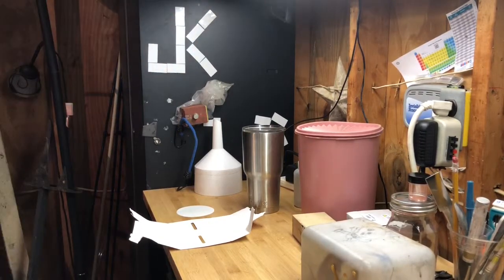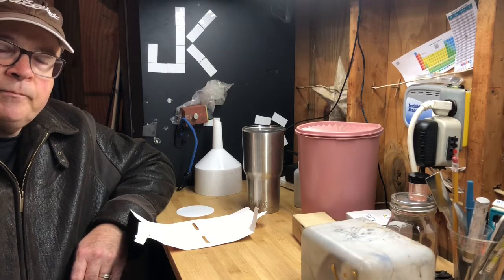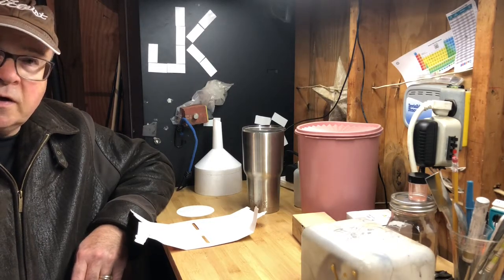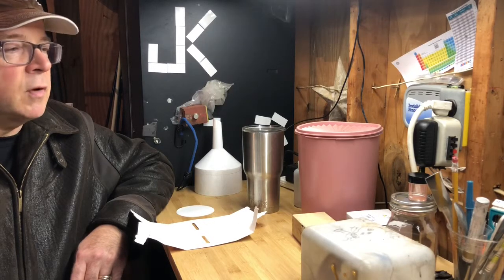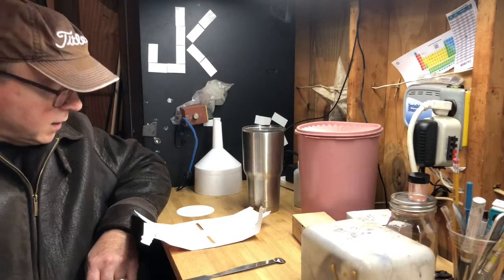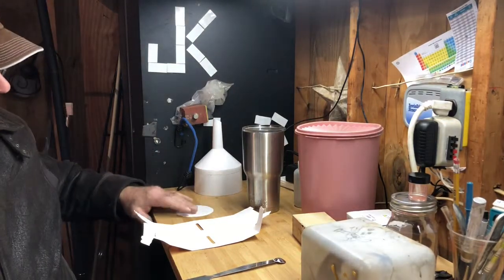Hey, it's the Reckless Retiree here. I just got done watching some more Shri Tips YouTube videos on recovering platinum. He took some stannous chloride and put some of the liquid — which should contain platinum — on filter paper, transferred it with a glass stirring rod. I don't have one, but I think I'll use this stainless steel spoon right here.